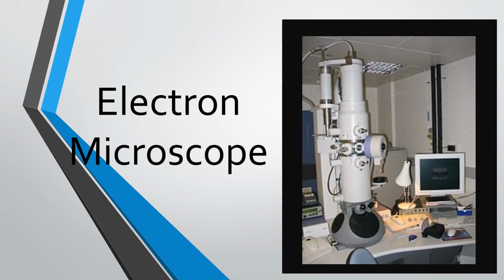So you can observe specimens in more detail using the electron microscope. Using the light microscope, you can magnify objects to a certain extent, but by using the electron microscope, you can magnify the specimens to a large extent and observe them in detail. So let's see what an electron microscope is.